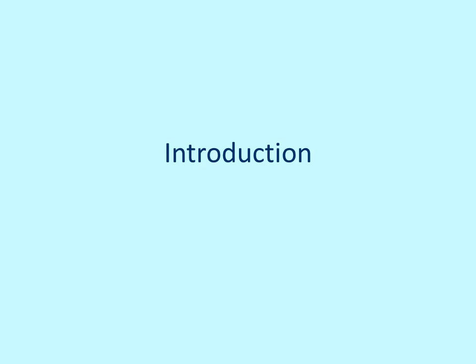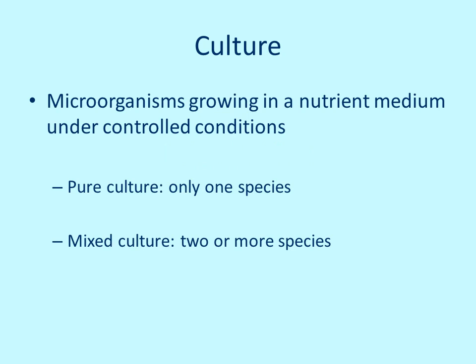This is just an introduction to microbiology lab. We're going to be doing a lot of things in this lab, but just some basic information as we get started. We often talk about a culture. That's just referring to the microorganisms that are growing in some form of a nutrient medium. It may be liquid, it may be solid medium, and we're growing them in the laboratory under controlled conditions.